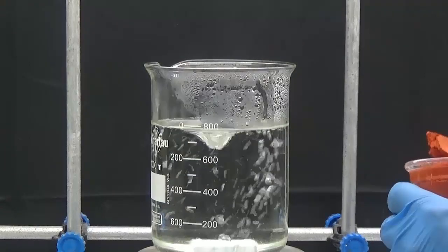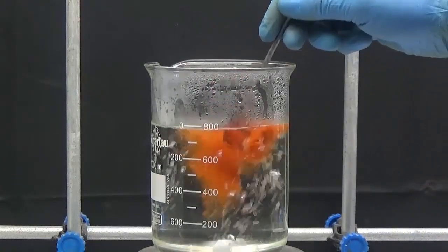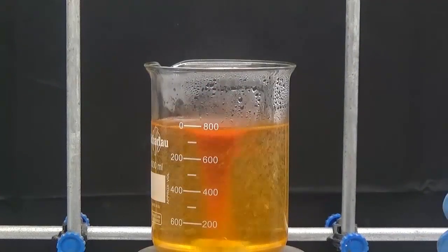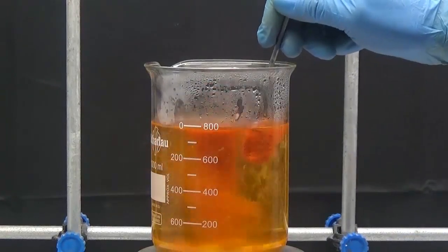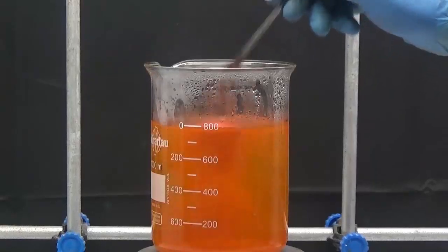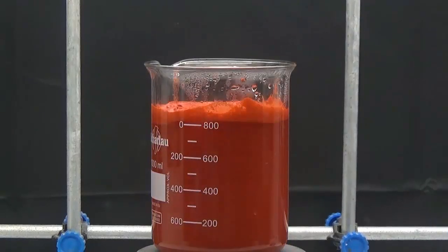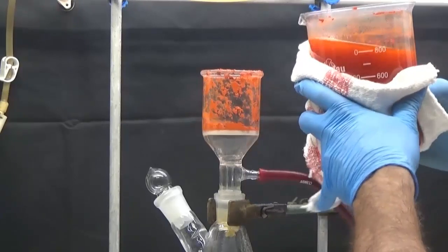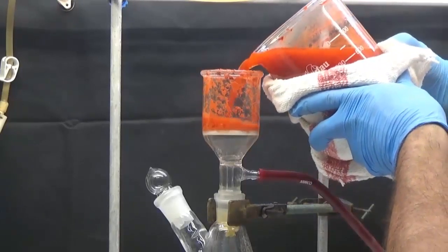The obtained solid is dispersed in 800 ml of boiling water to eliminate the phthalic anhydride. Without cooling, collect the solid by filtering by vacuum aspiration.